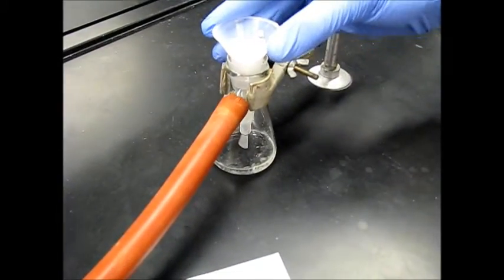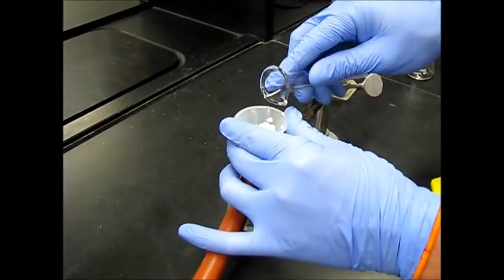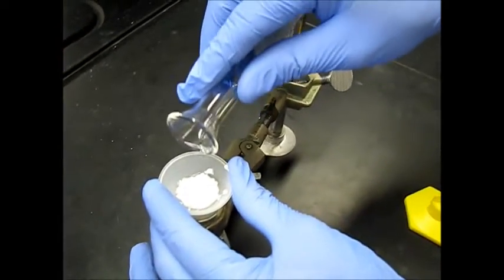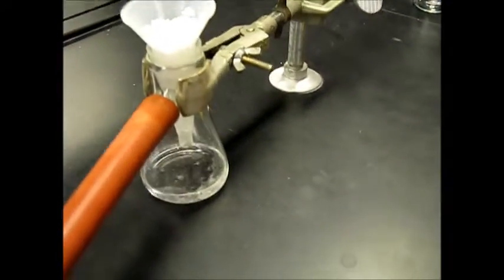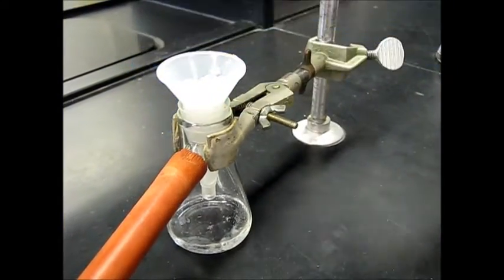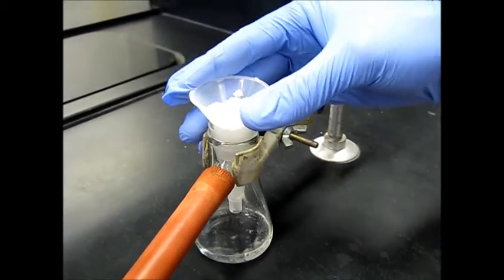So we've gone ahead and let it air dry just under vacuum for around 2 or 3 minutes. So this is that last little step before we actually finish out for the actual measurement of our product. So we're just going to add this 2 mL of methanol just to get that last rinse. According to the procedure, we're supposed to let it air dry after that rinse for 5 more minutes. So we'll check back in after 5 minutes and finish out this last part.